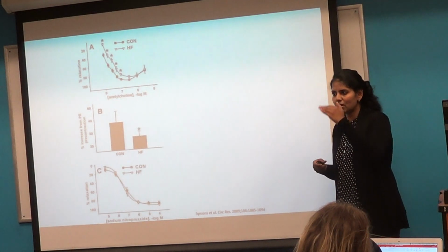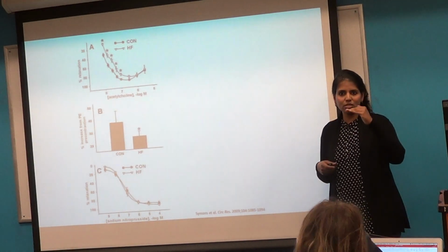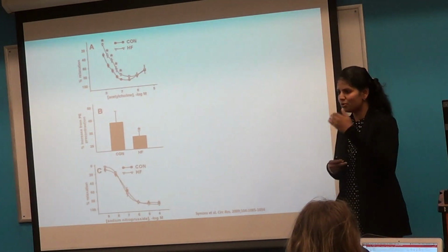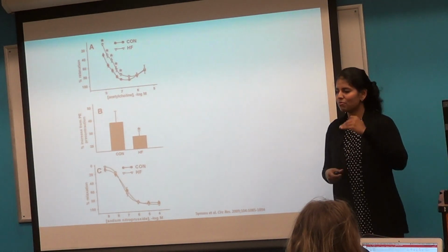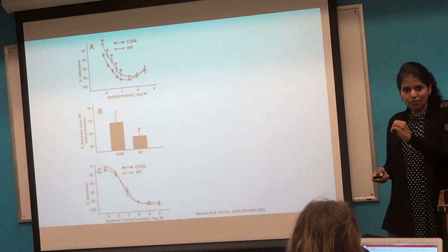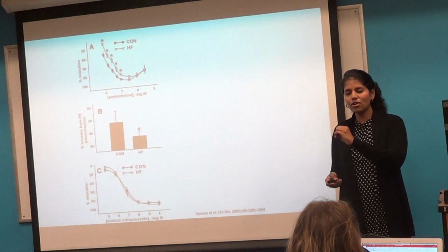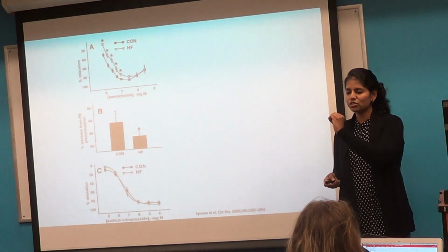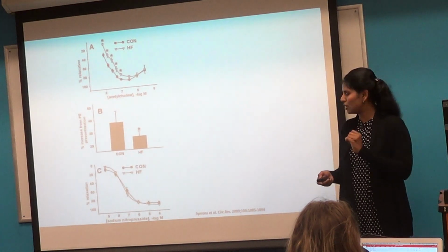You repeat it several times and see if you have consistently stable, repeated measures showing you the same thing. Okay? So we know that in the high-fat fed mouse, they have less nitric oxide. They are having some vascular dysfunction if the vessel is not relaxing as much.